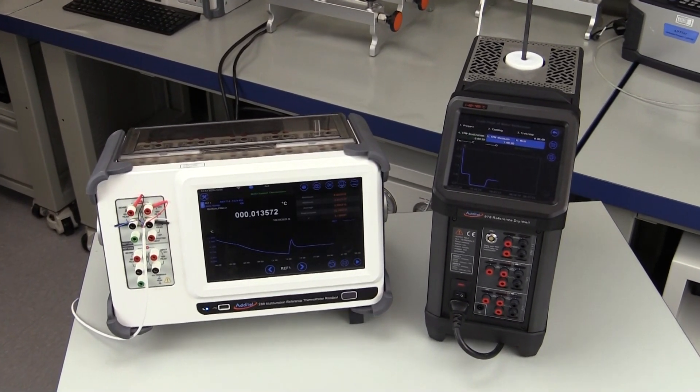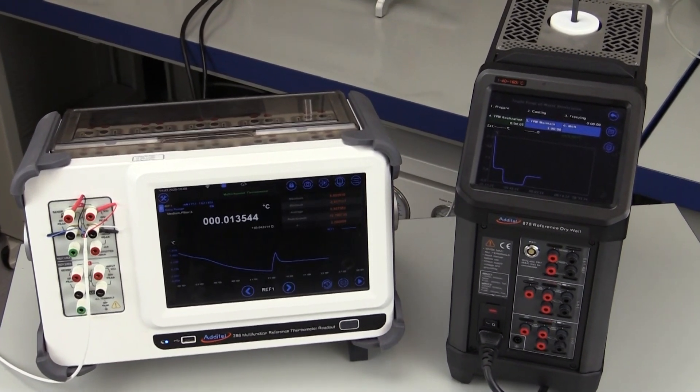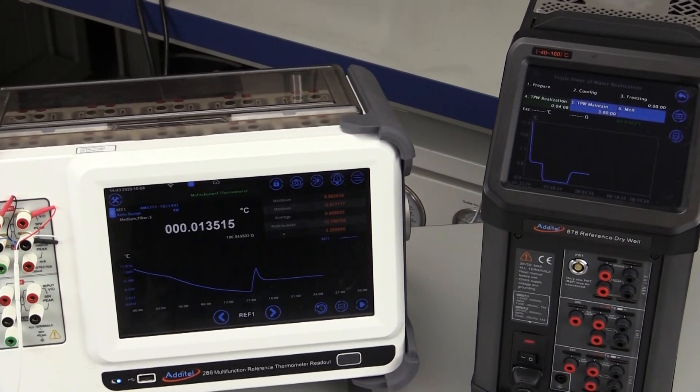With the Additel triple point of water system, you don't have to have the process option. An external readout can be used and the program will run the same, with the exception of the automated update of the resistance of the triple point of water.